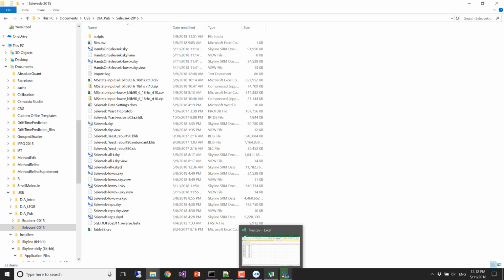Okay, so we have 8 replicates, and the CV histogram just shows us, for the replicates that we can detect this thing in, what is the CV? You're familiar with the concept of a CV, right? It's the standard deviation over the mean, and it gives you some measure of how reproducibly you can measure something.